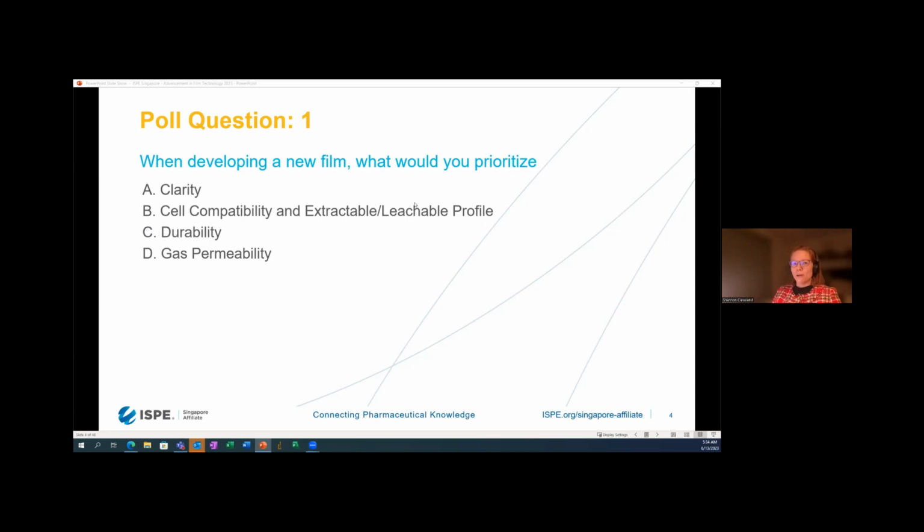I feel like it's a little jeopardy here. All right, we'll just have a few moments and then we can share the results. All right, so most people think cell compatibility and extractable leachable profile and durability. I think you did pretty good.